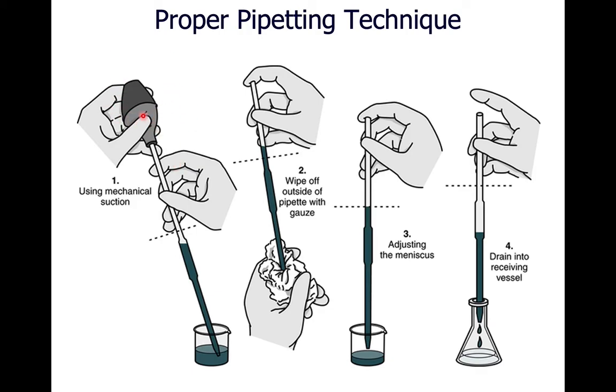You will use a different type of bulb than this, but basically the idea is going to be the same. I describe it as you almost want this bulb to just sort of kiss the top of this. You most certainly do not want to try to jam it in. It's not designed to do that, and that's one of the ways of breaking it and then cutting yourself as you break it. So you want it basically to just sort of kiss the top. This dashed line marks the calibrated line that you're eventually trying to get to.